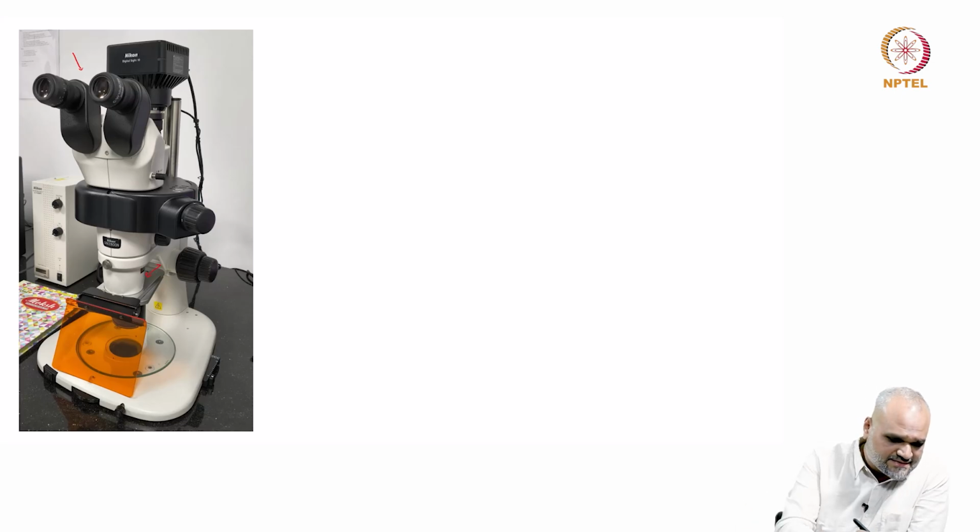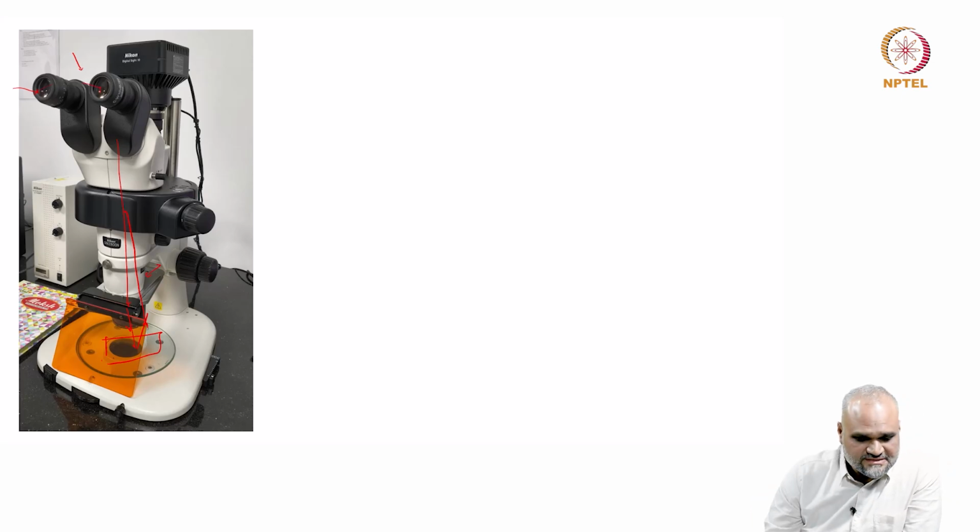So, the idea is the light goes through the microscope column. I place an object at this location, and there is some interaction of the incident ray, and when it is reflected from the surface, this travels through the same lens, and you start seeing the object here through your eyepiece, or the magnified image through your eyepiece, or you can record the same information on a camera here.